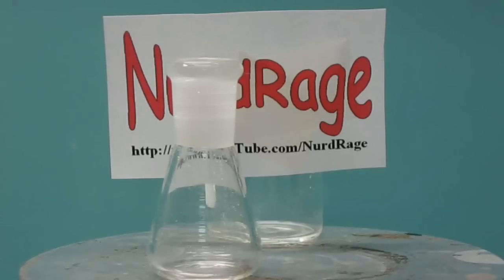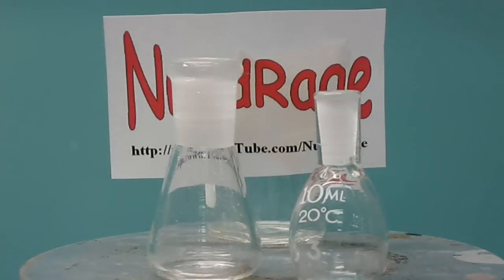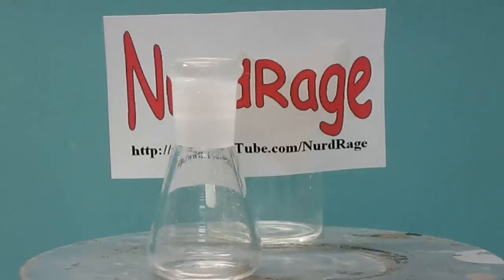To get a sense of the size of the scale, guess how big that flask is. Now let me show you — that is my hand. And this other flask is only 10mL in volume, less than a tablespoon.